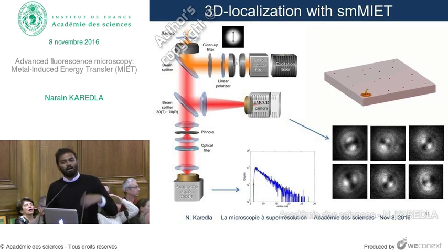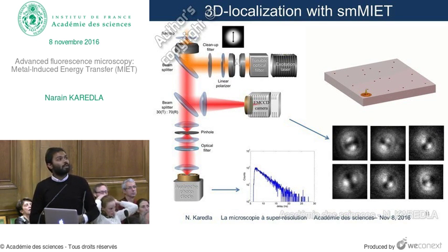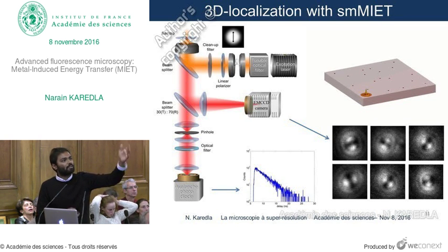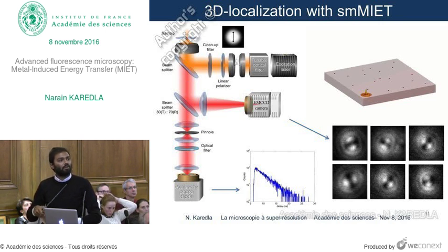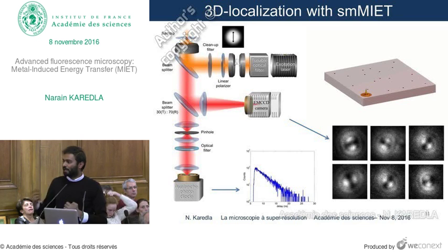So we now combine this with a confocal microscope, and this is a slight modification that we do. We introduce a beam splitter which reflects 70% of the light onto a camera, which can be defocused, and the rest of the light is focused on the lifetime detecting module. So the idea is that you scan, find the position of the molecules, and simultaneously record the lifetimes and the orientations to get both pieces of information to get the Z position.